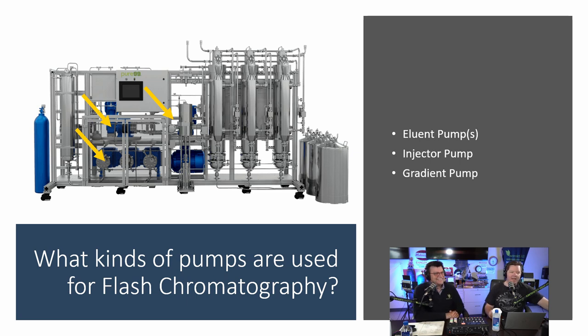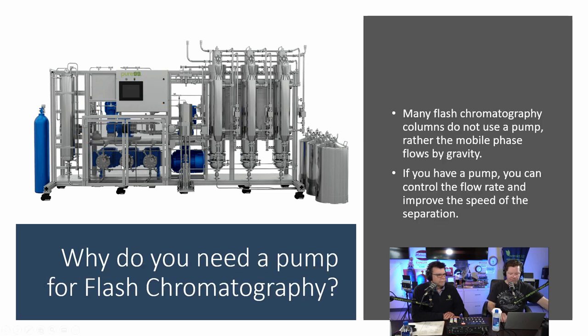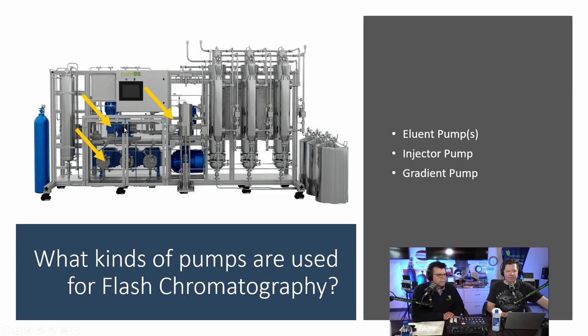So, what kinds of pumps are used for flash chromatography? Essentially, there are three different types of pumps, and there may be others. Right here you have the eluent pump, which is the main pump, and that usually makes up most of the flow. Then you have what they call a gradient pump. If you want a very rich gradient, you take the flow from here, mix it with the flow from there, and you do that online at high pressure. So this is a high pressure mixing system. That's a key aspect.